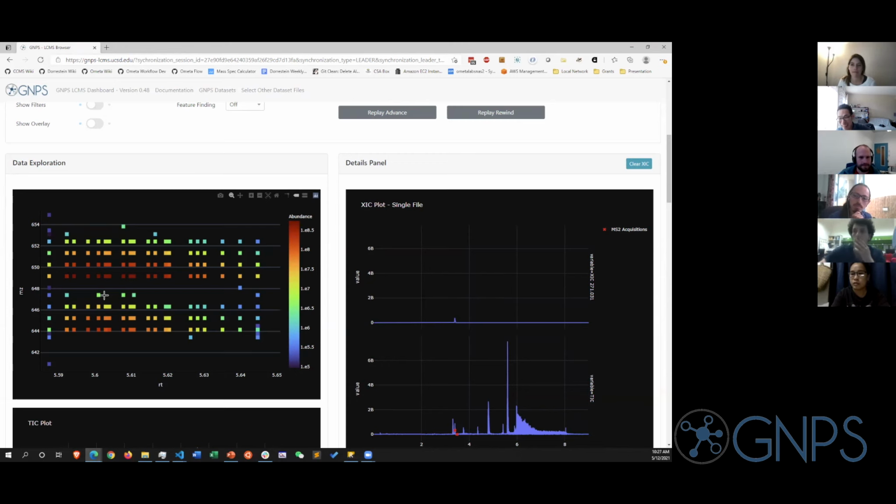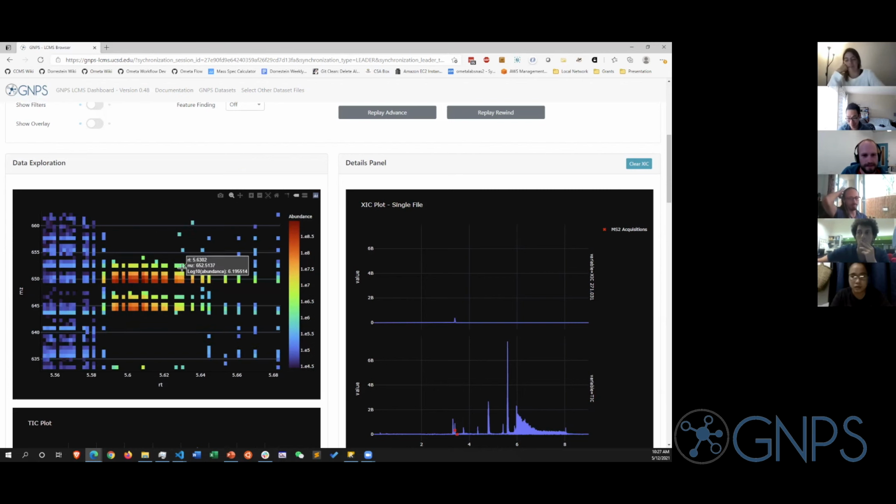It's okay if he doesn't want to do it. Sorry, what do you want me to explain? So how do you use the heat map?